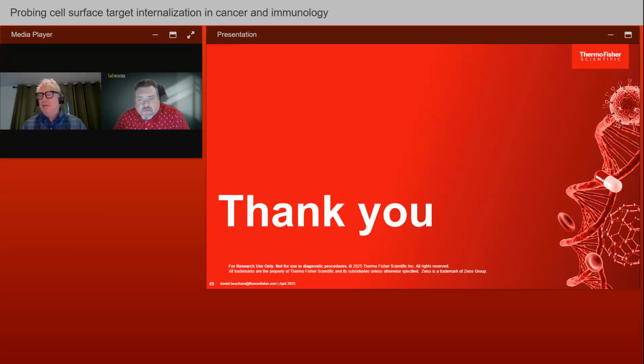The LysoSensor dye less so. There is definitely signal loss with the LysoSensor, but we haven't generated enough data to really put a number on something we'd stand by just yet. It's best used in live cells, and you would definitely suffer a knockdown in detection of internalization in those lysosomes after fix.